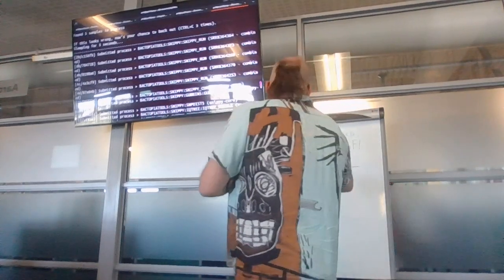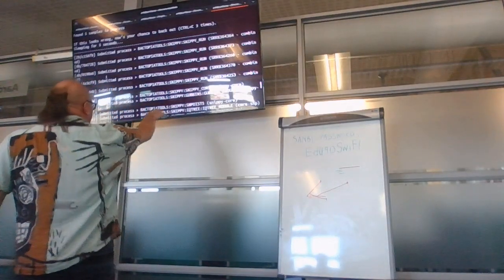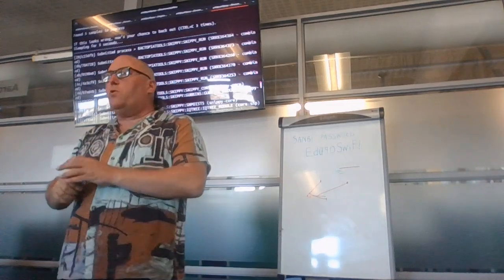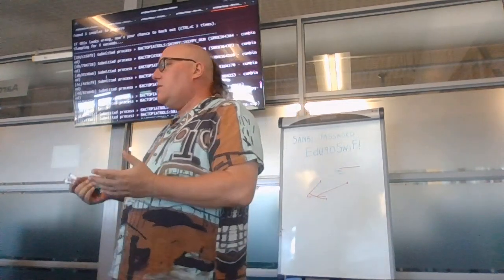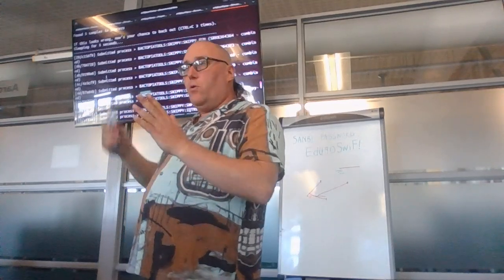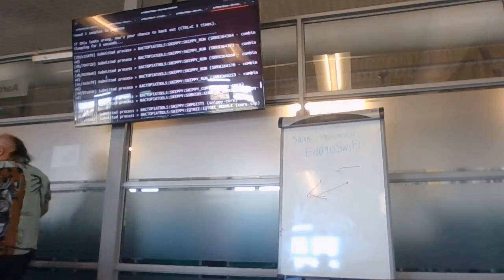Okay, so you get these kind of long branches. So Gubbins is being used to do that filtering. Snipdist, if you've worked with some of our previous workshops, you'll have seen Snipdist. It just computes a distance matrix of SNPs between all the different samples. Okay, it's also one of Torsten's tools.